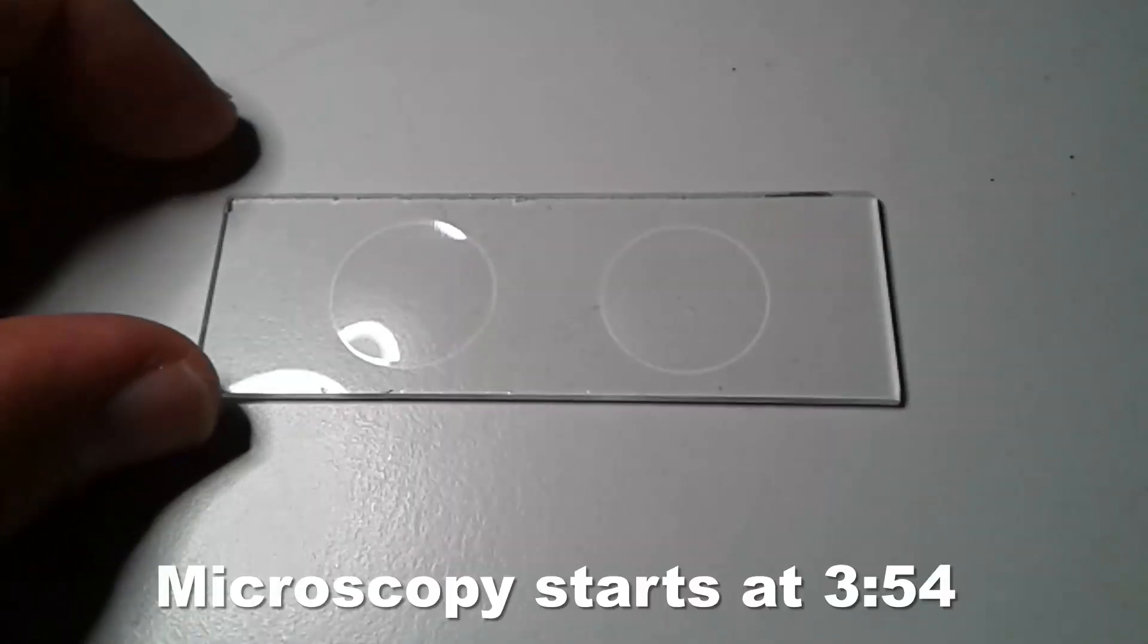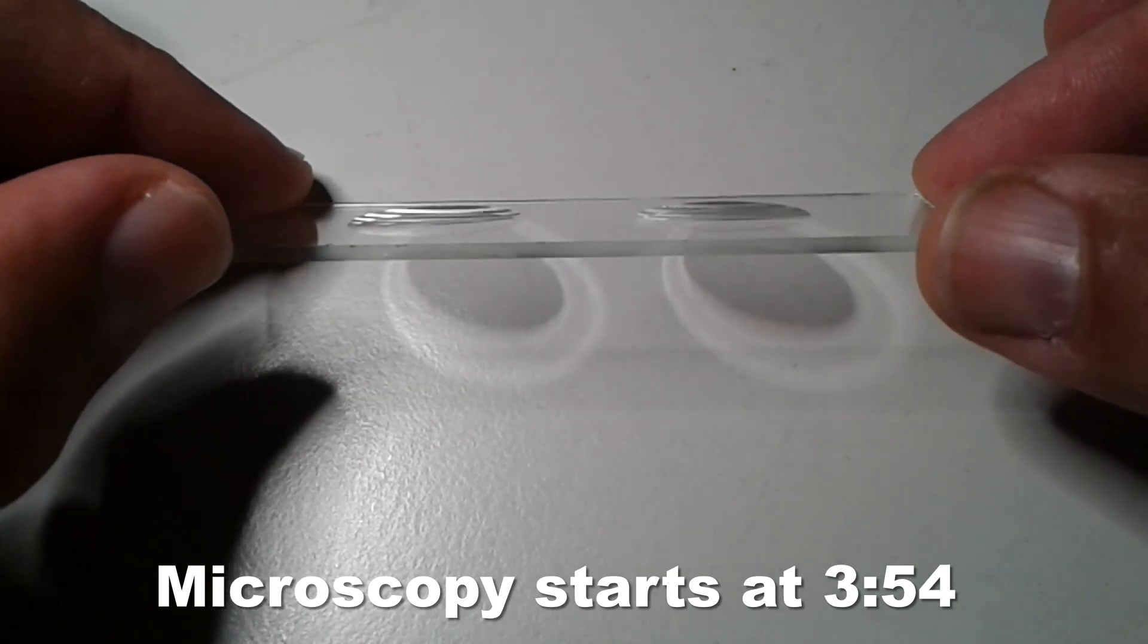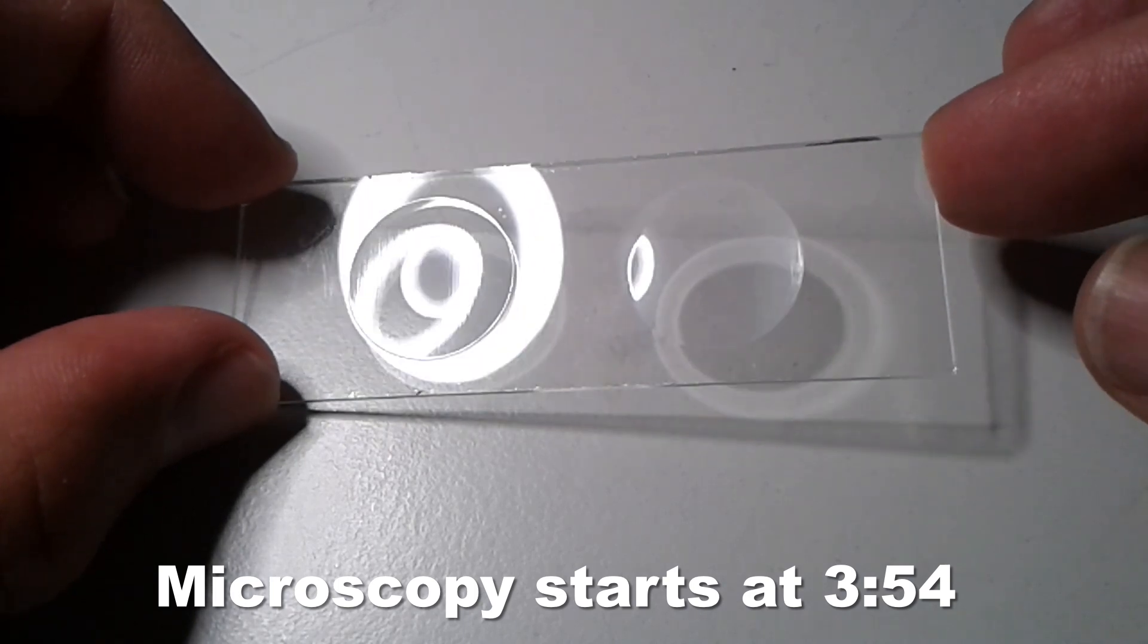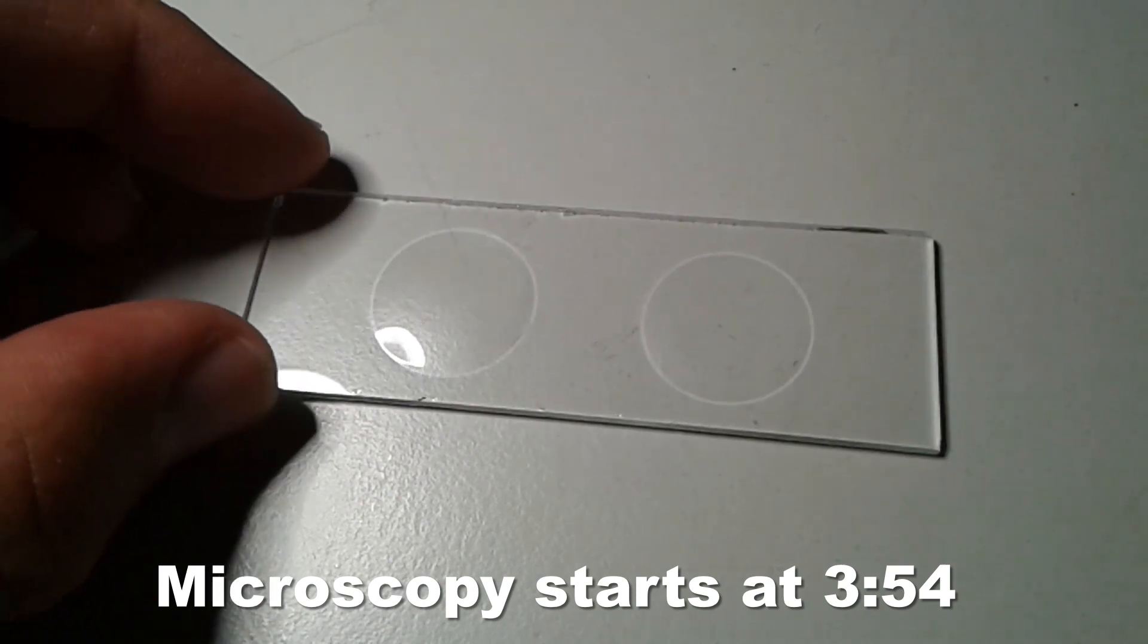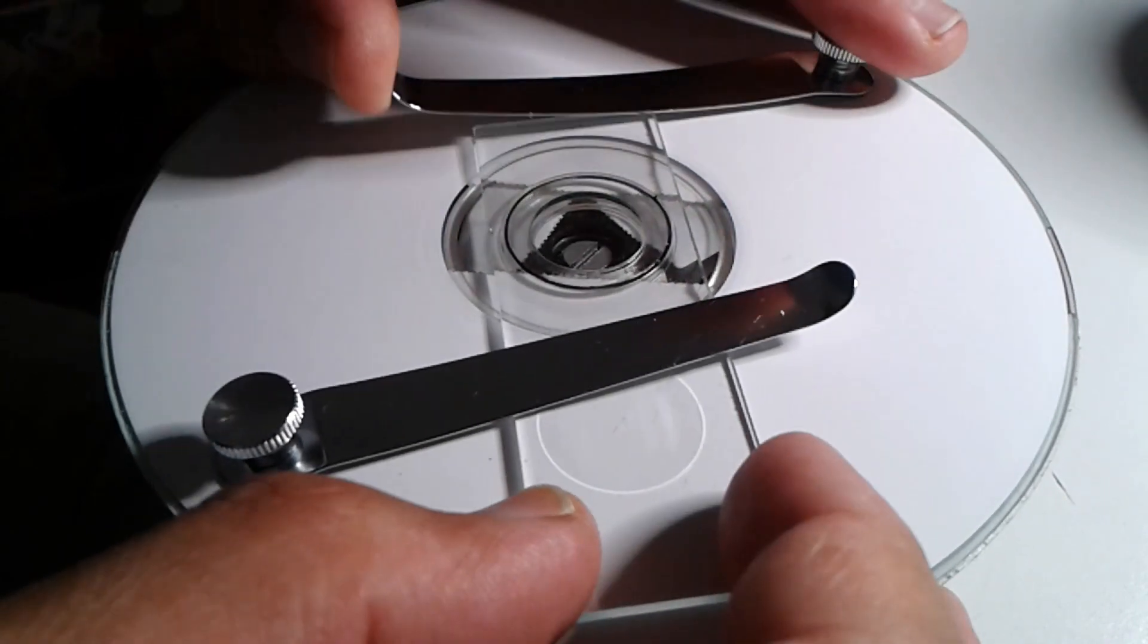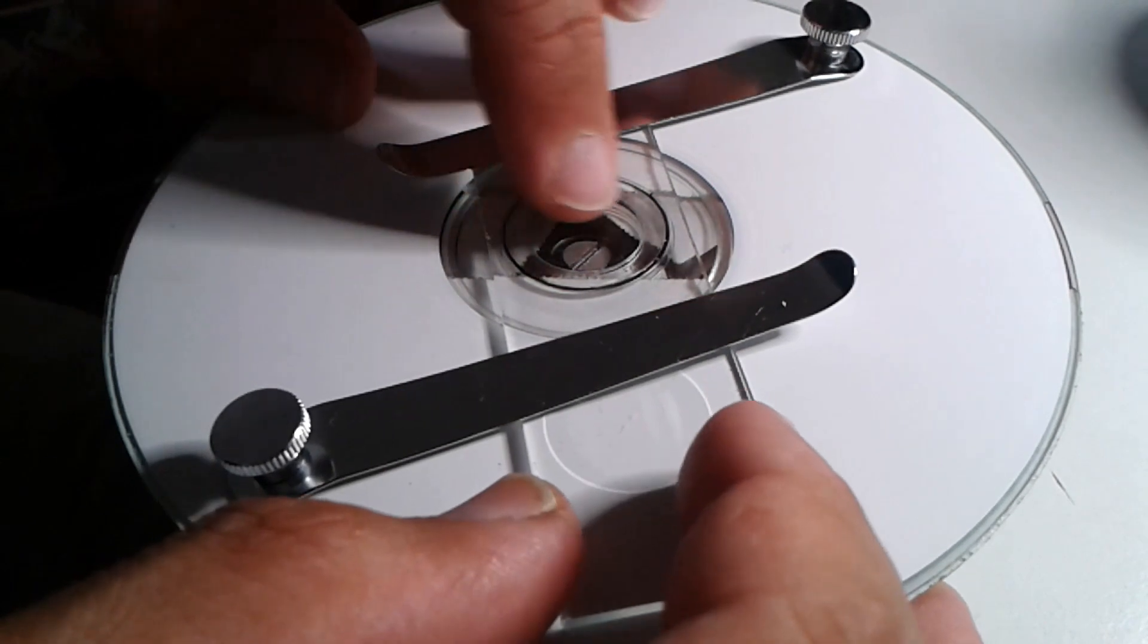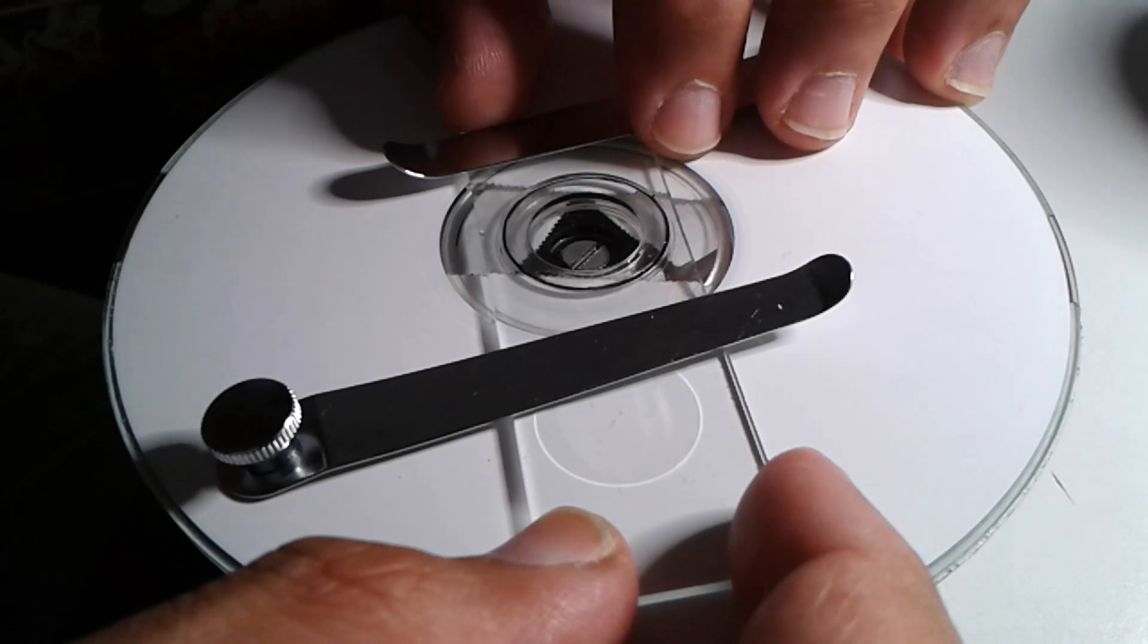Now I'll try something different. I've got a slide here with depressions - they're concave. If you want to jump directly to the microscope, skip ahead to three minutes 54. Using a CD and a fidget spinner, I made myself a slide ringing table. In this depression I'm going to put the pollen and use nail polish to glue the cover glass on top.